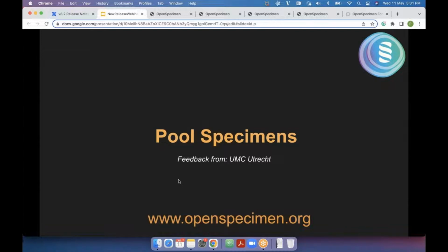Okay. So the next feature is pool specimens. Again, as I said, as part of the workflow features, this was a comment given by UMC Utrecht, where for a lot of their SOPs, they want to pool specimens. But this is not just part of workflow. This is now a generic feature where you can use pool specimen as a feature.